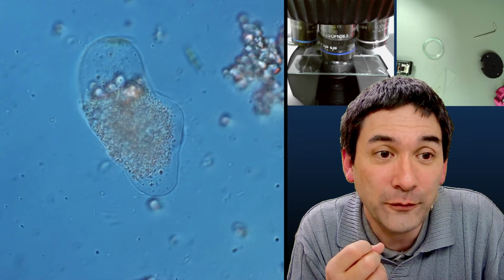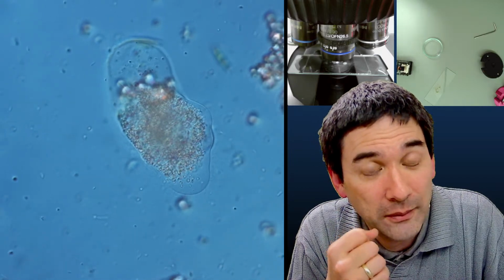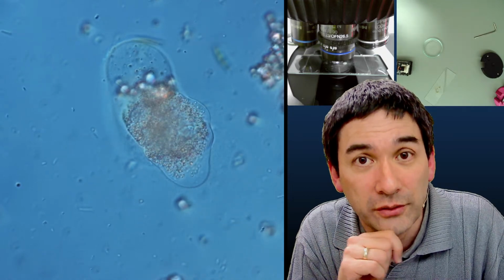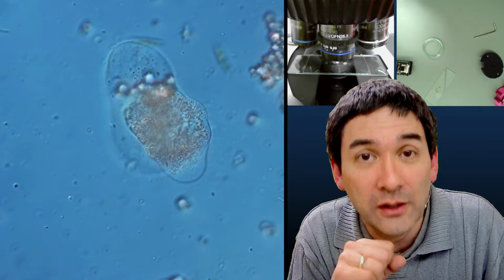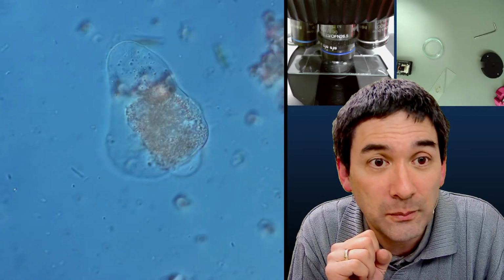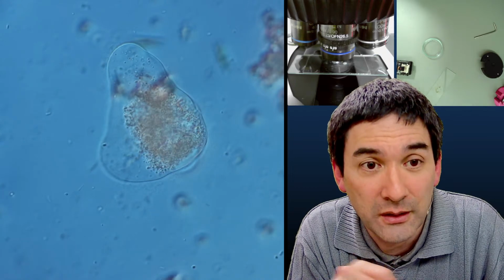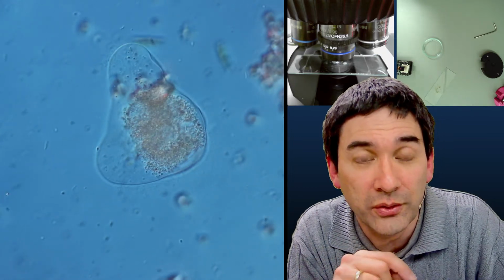Yeah. And for those of you who are a little bit new to biology and microscopy, the amoeba that you see here is a eukaryote, right? It has cell organelles, it has a nucleus, and the dots that you see swirling around are prokaryotes. So these are also cells, but they're significantly smaller. These are basically the two cell types that you have: the eukaryotic cells with a nucleus and all of the cell organelles, and the much smaller prokaryotes, the bacteria.